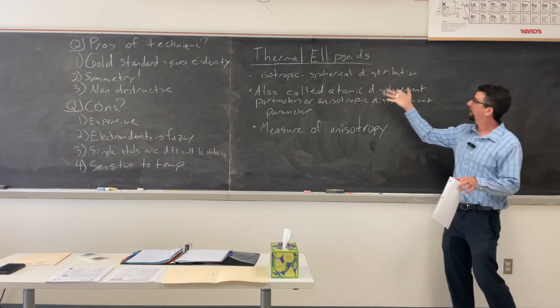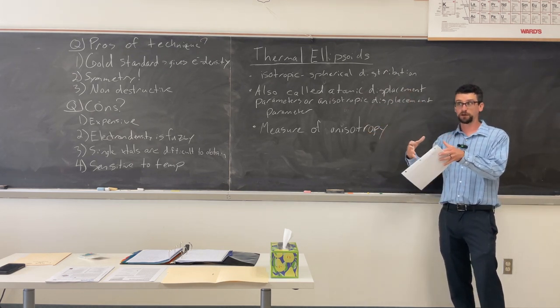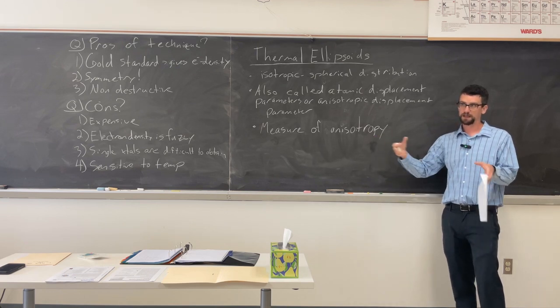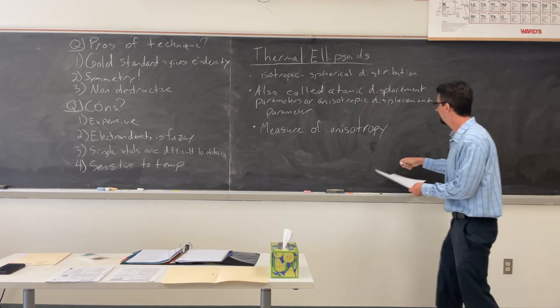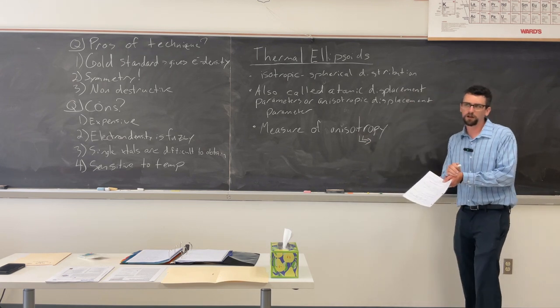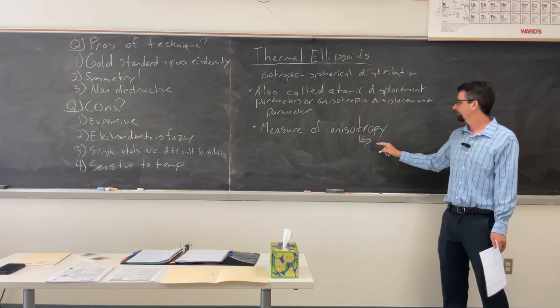So, isotropic systems are spherical in their distribution. What does this mean then? The less spherical you are, it's oval. It doesn't necessarily have to be; it could be an ellipsoid or it could be a plate.